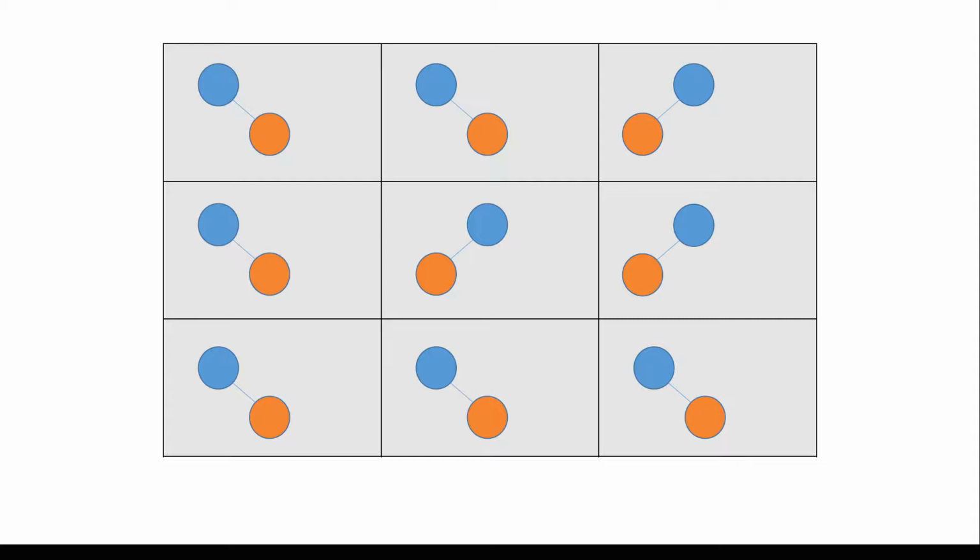Crucially, those occupancies can't add up to more than one, so we're still modelling a real crystal. We know that it has to be physically meaningful, and the total occupancy of molecules in one unit cell can't be more than one. So we can use that as a constraint.